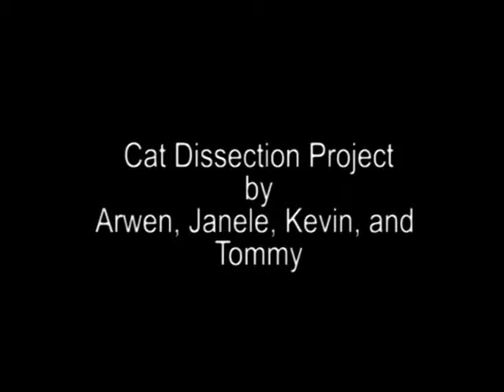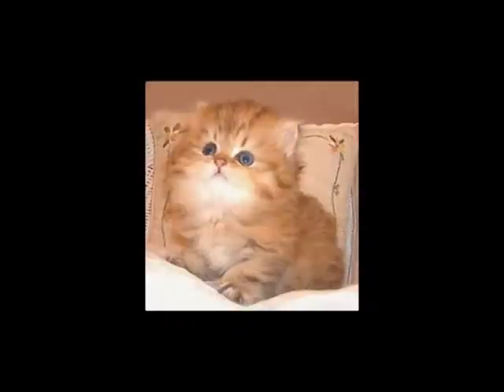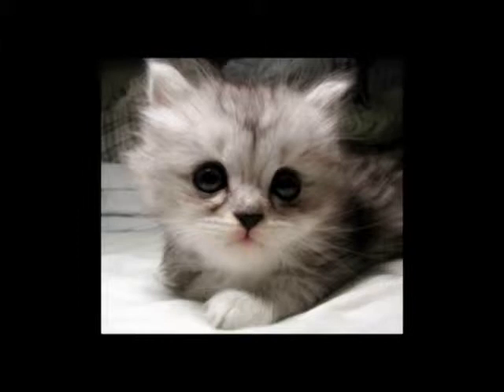There are many different kinds of cats in the world. Fat cats, fluffy cats, and cute cats. But today we're going to go over an unfamiliar kind of cat, and that is called the dead cat.